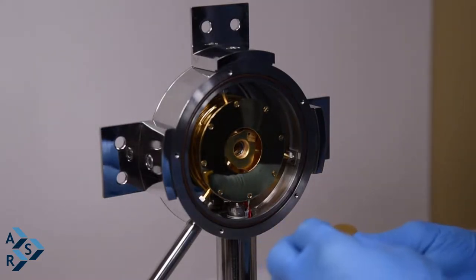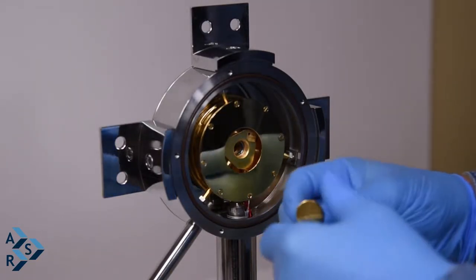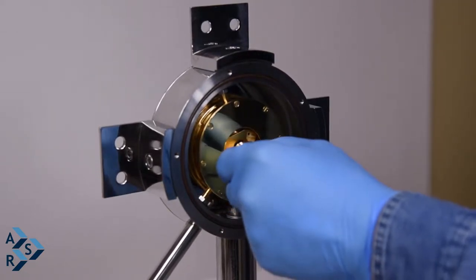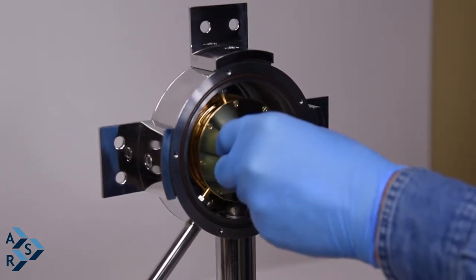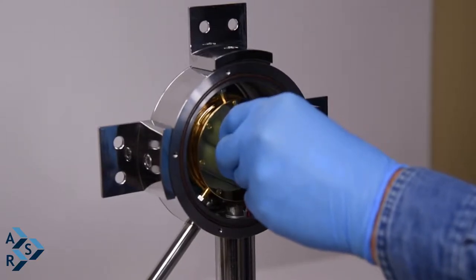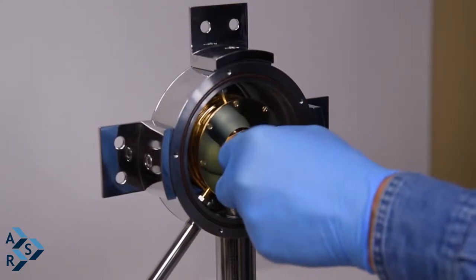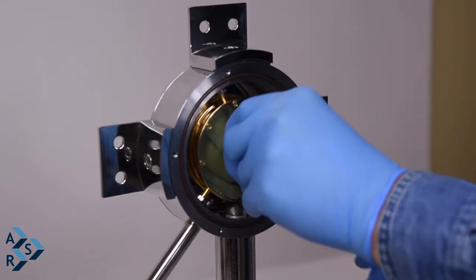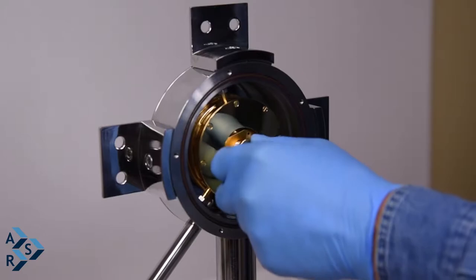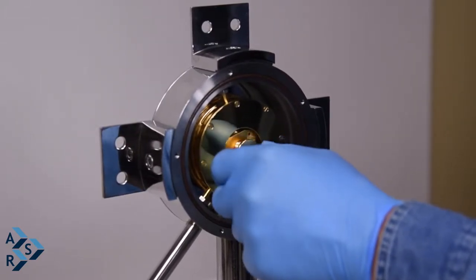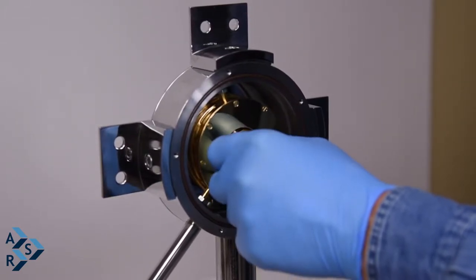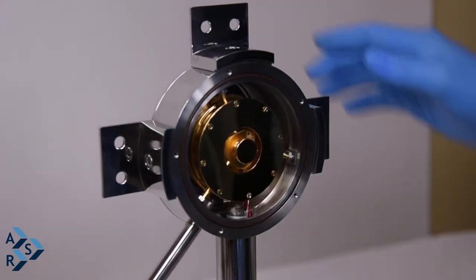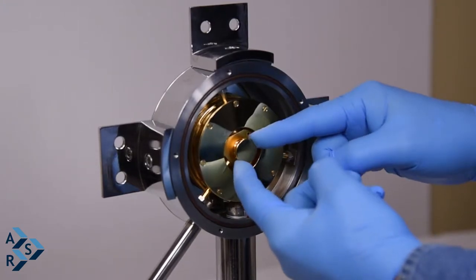I'm using another sample holder, this is for reflectance. Same thing, you can readjust your jam nut. All the threads are right handed threads. Again, you could adjust your height using a caliper. That way then it locks it in place.